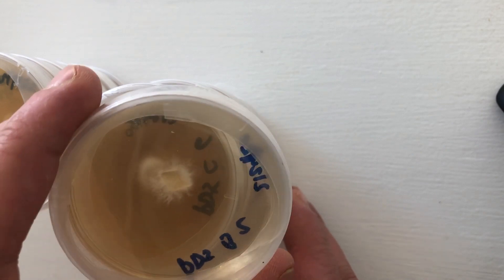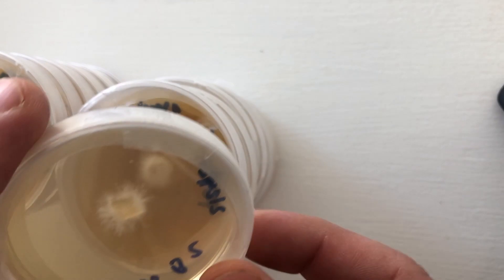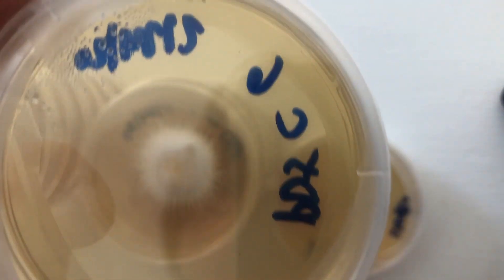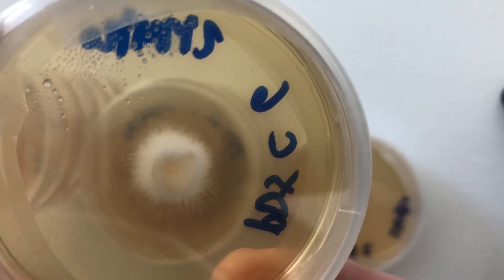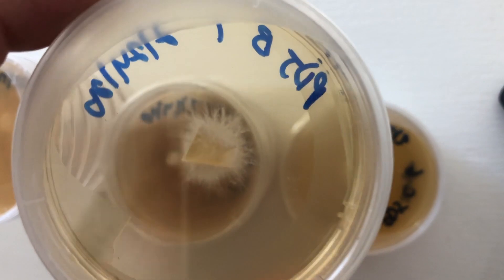This one has more of a filamentous, cottony look — really healthy mycelium. And then as I go through, you can see this one is a lot more dense, with more uniform growth, not really stretching for nutrients. Here's another isolate here.